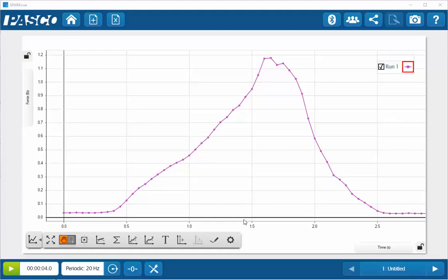This is a video showing the single data point selection process and the tools that are available through that. I'm going to place my cursor over a data point on my graph and click. Once I've done this, three different tools are now available. The far left one is the Smart tool, the middle one is the Slope tool, and then finally the one on the right is the Annotation tool.